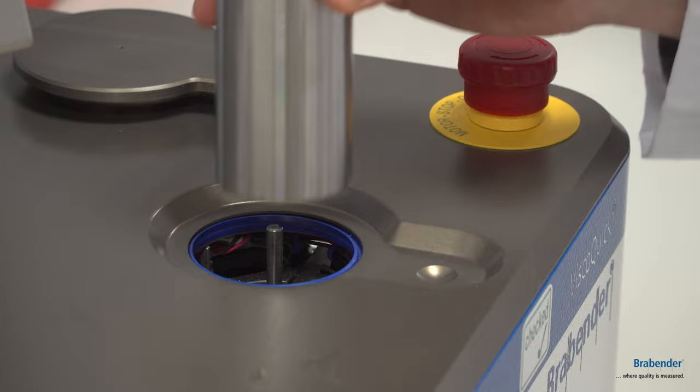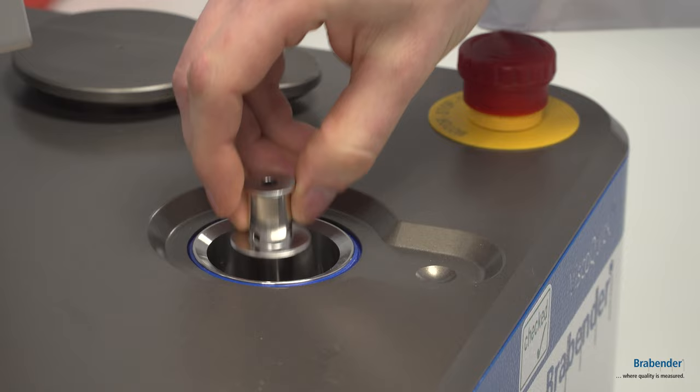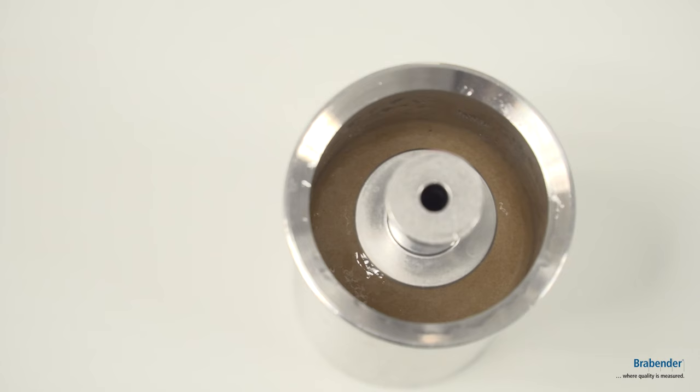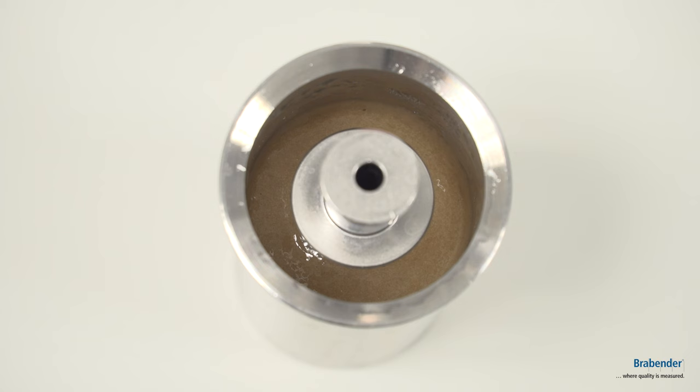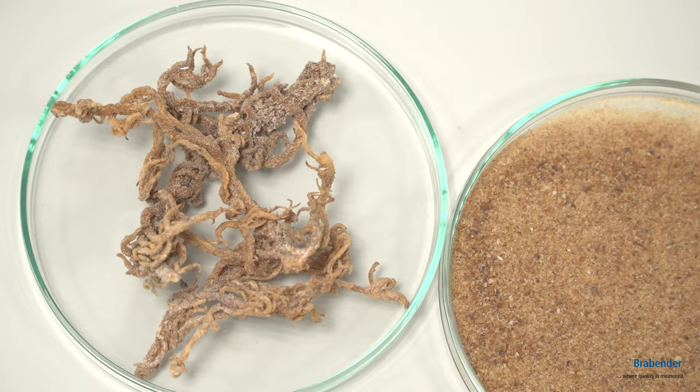For your industrial processing, you need a constant quality of your product in order to run your process most efficiently. Using the ViscoQIC, you can determine this quality of your seaweed product within 20 minutes.